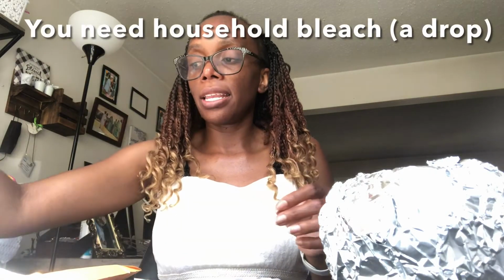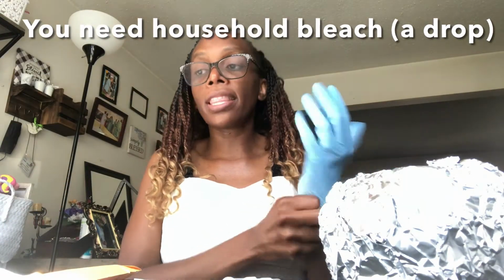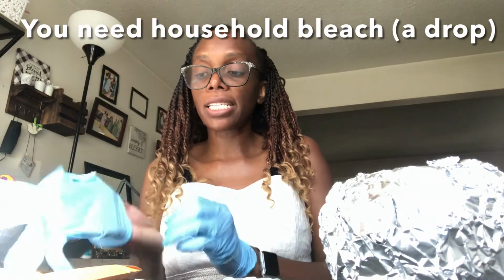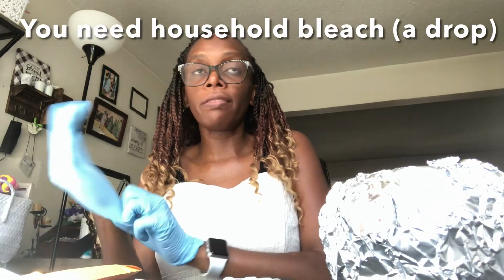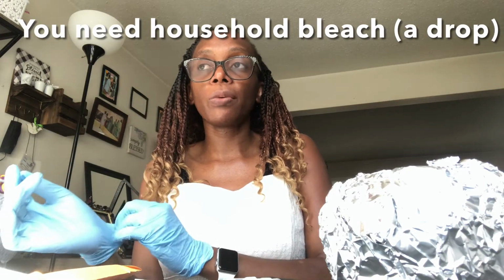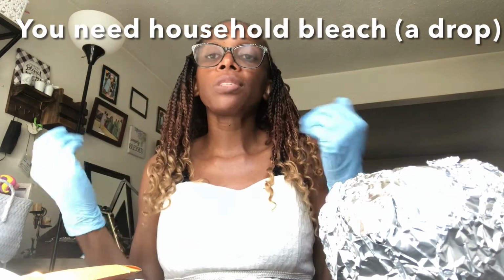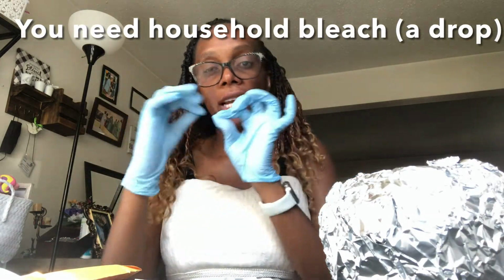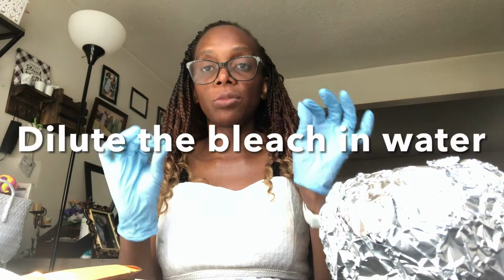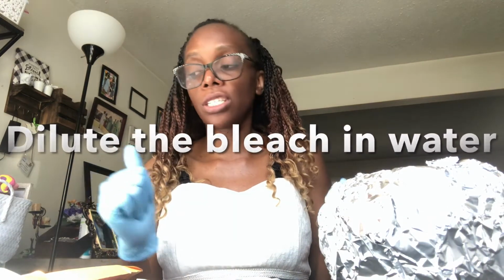Okay, and then make sure you get your gloves. So I'm going to start this, and I have my gloves. Oh, and then the last thing is you need household bleach. So like I said yesterday, household bleach, for most of us, the percentage of the active ingredient, sodium hypochlorite, was like 6%, 7%, 8%. And so we have to dilute it where we have very little bleach and a lot of water. You don't want it to be super concentrated. We need just a low concentration of the bleach.